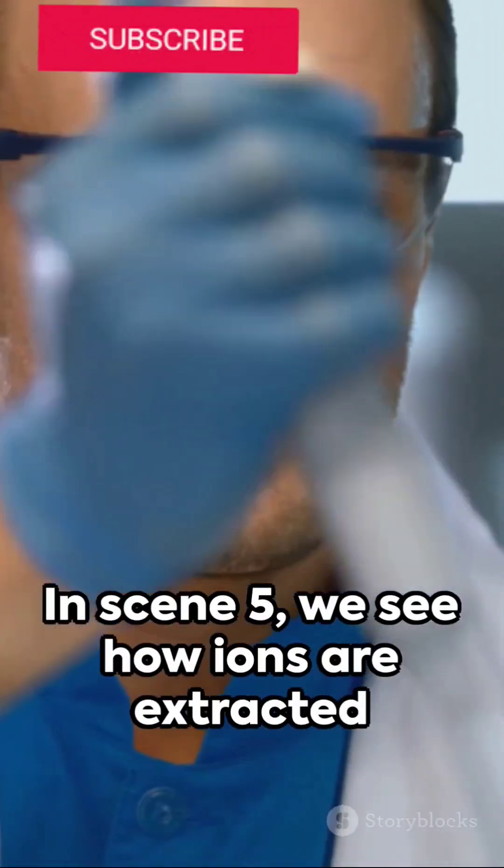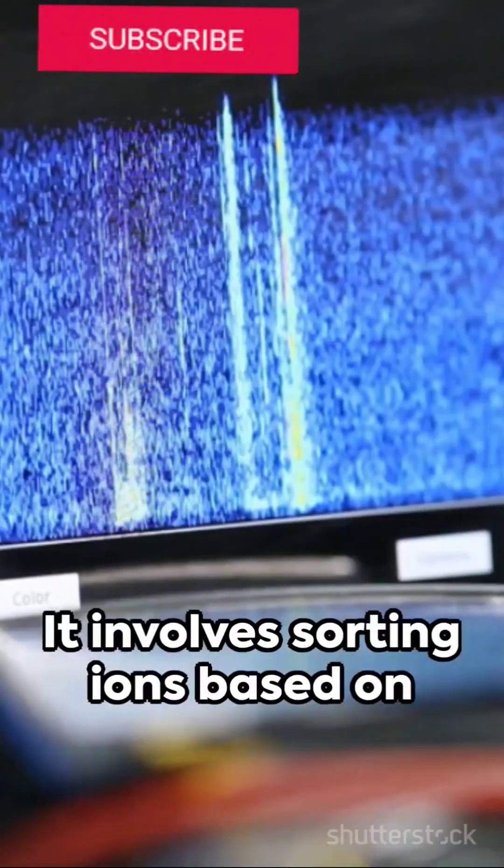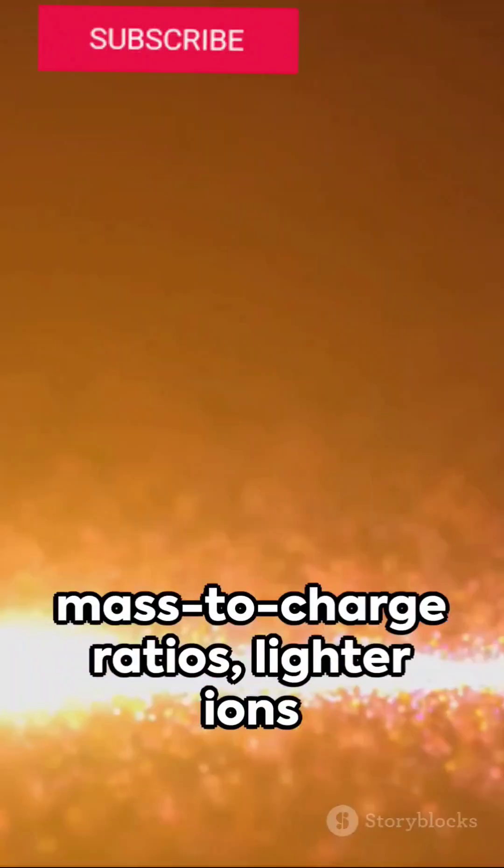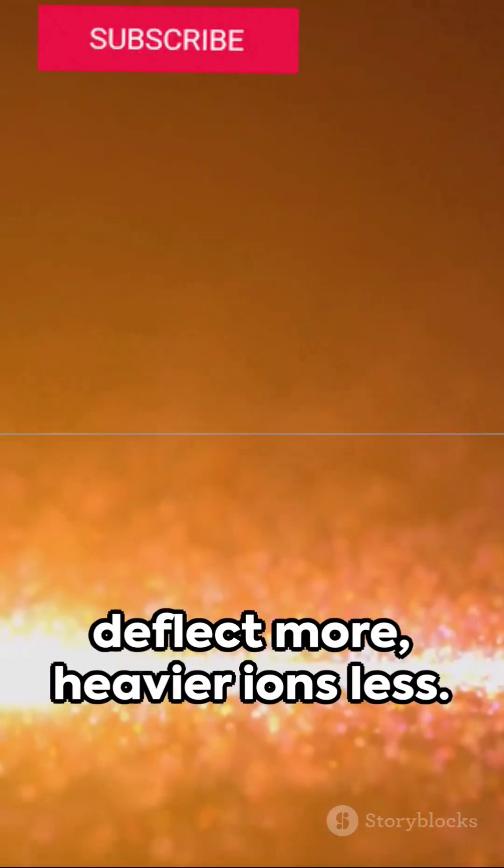Ions are extracted from the plasma and sorted based on their mass-to-charge ratios. Lighter ions deflect more, while heavier ions deflect less.